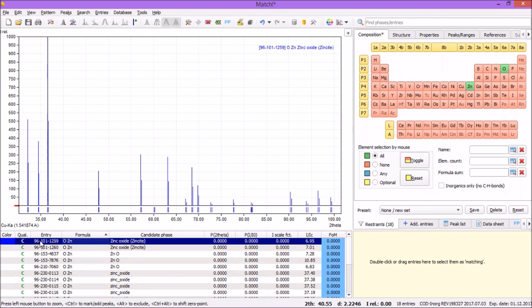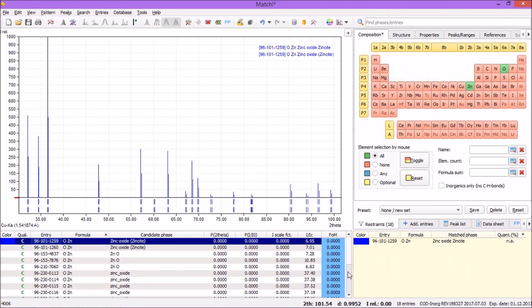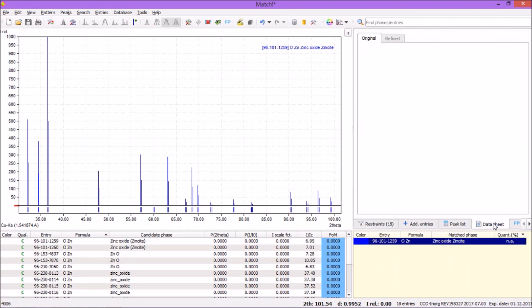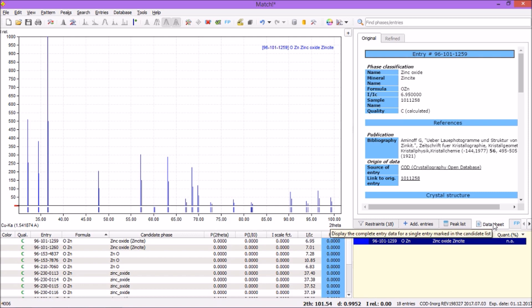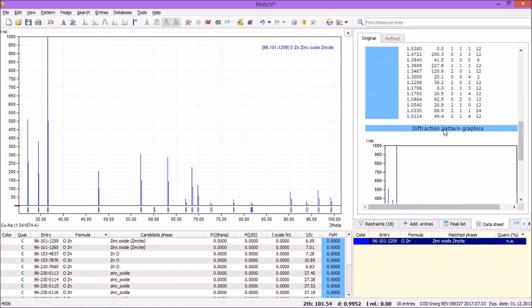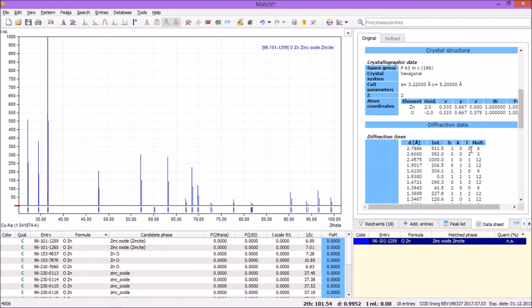So how to do that? Just click it and drag it over here. Yeah, it has come. Let's have a look on the data sheet. You can see this.